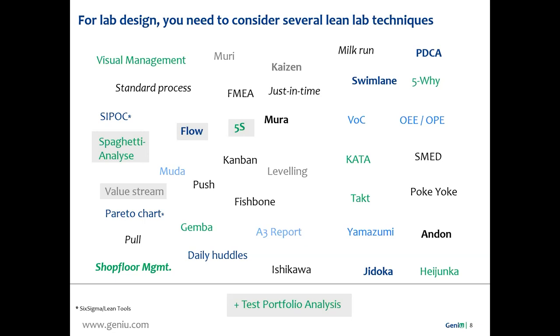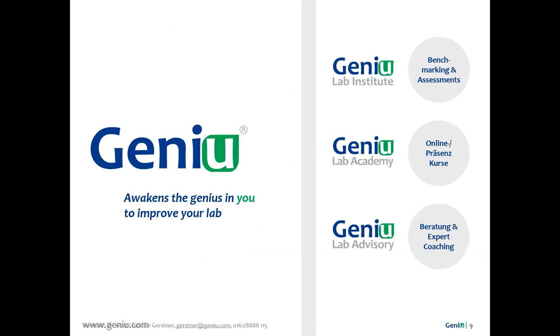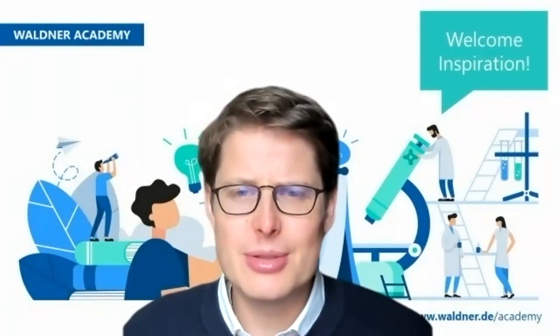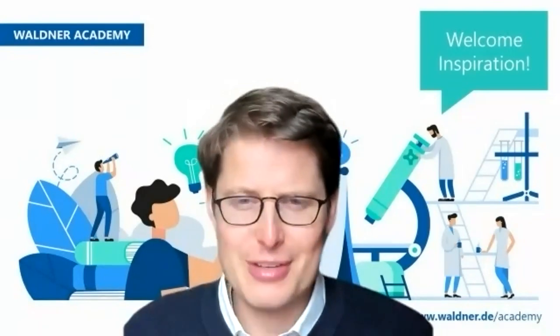Underlying to all of that, and that's why there's the line in this presentation, is that for a good redesign, you definitely need to analyze your test portfolio to see what interdependencies are there. Because this is not a lean technique, but a technique we nearly always apply, because it helps you really to design a very good layout. So with these remarks, I would like to close. And I'm happy for questions related to this topic, if you have any.